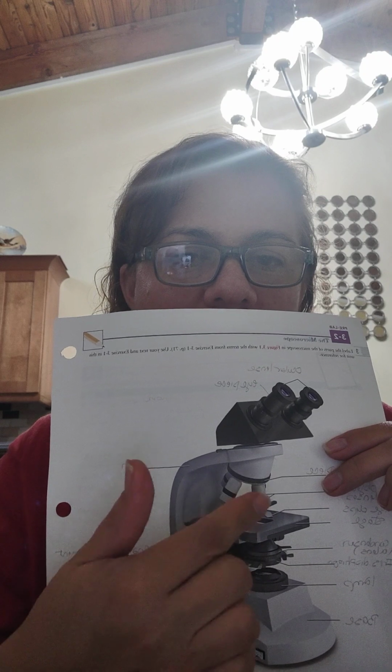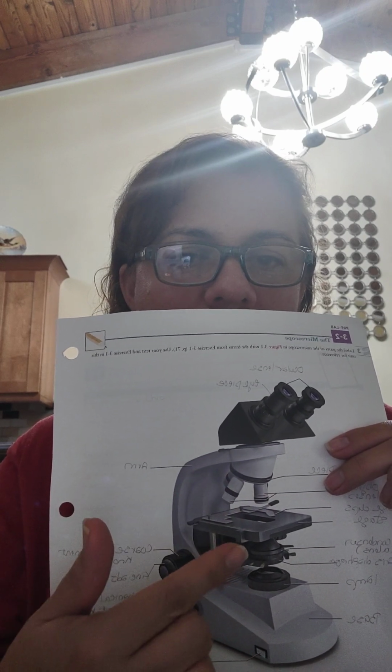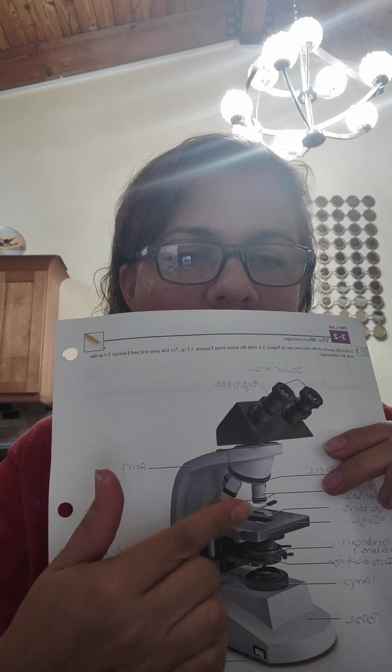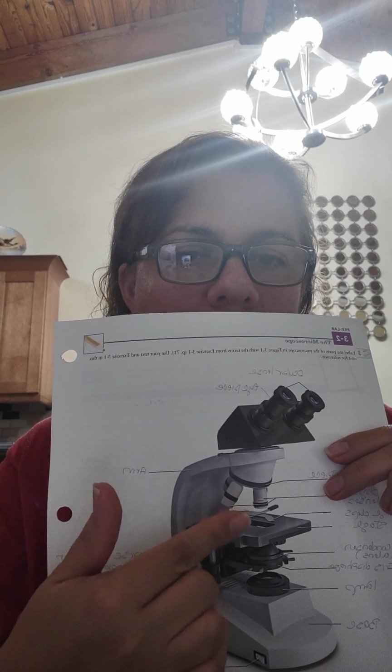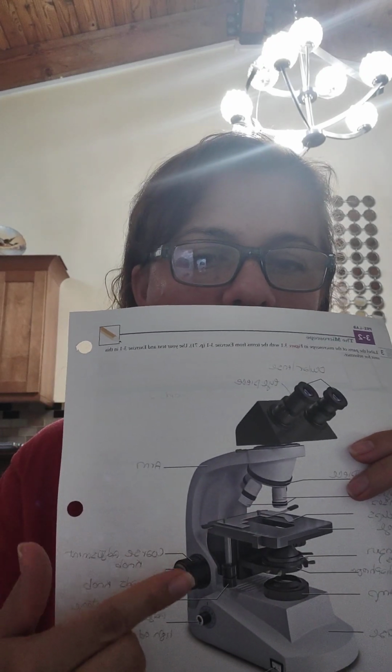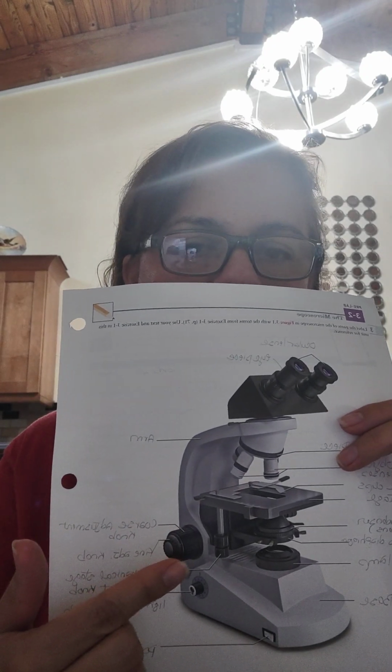So since they are different lengths, you have to move the stage closer or up, I should say higher or lower, according to whatever you need. So this coarse adjustment knob lets you do that.